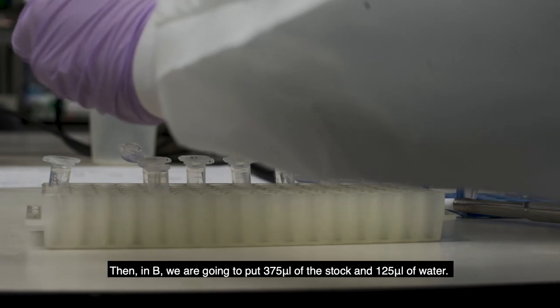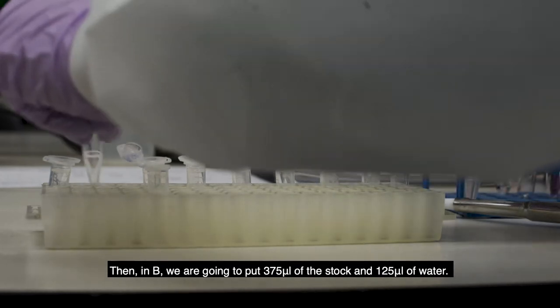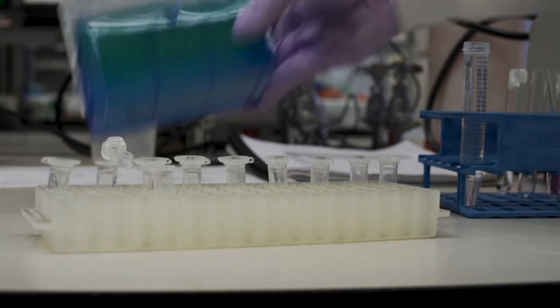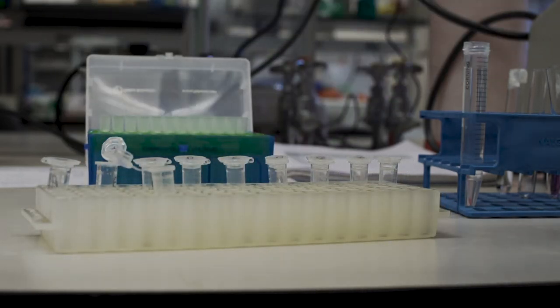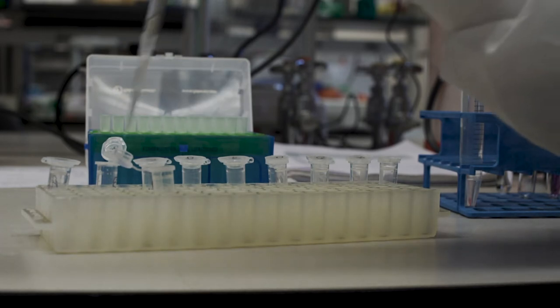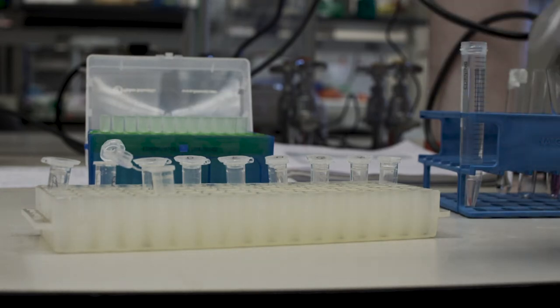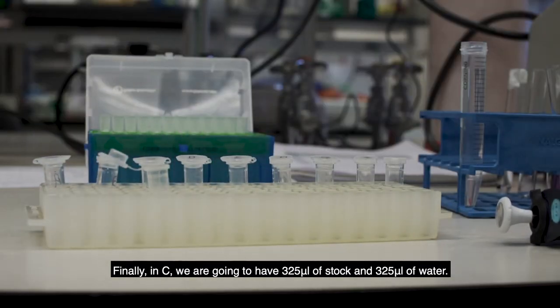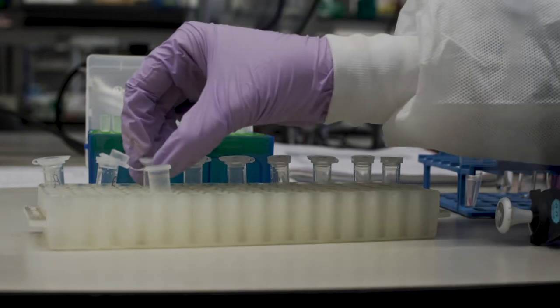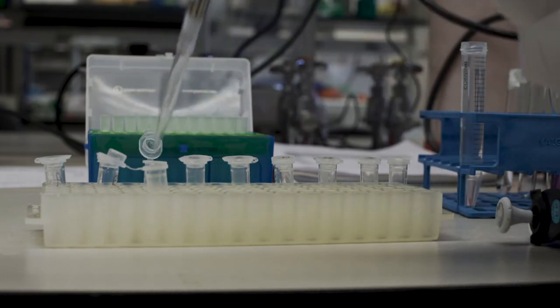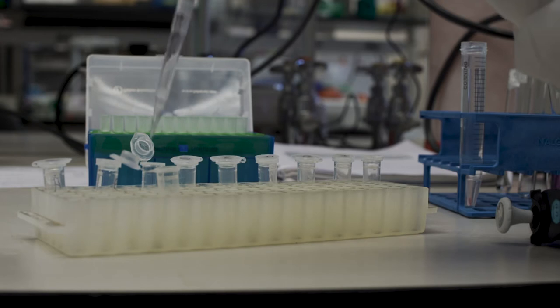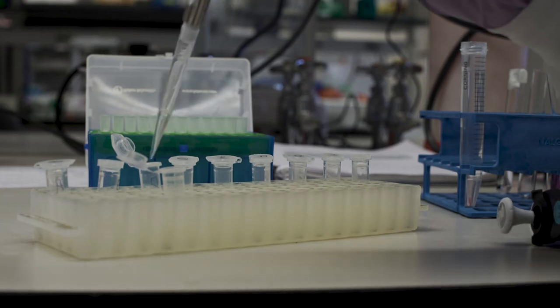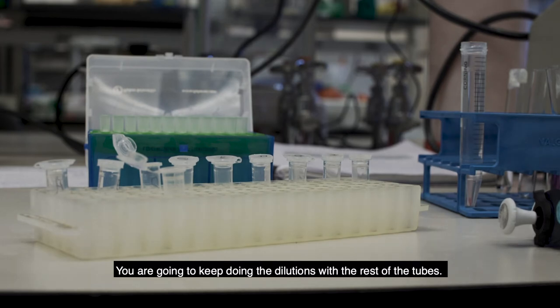And in B, we're going to put 375 microliters of the stock, and then 125 microliters of water. And then finally in C, we're going to have 325 microliters of stock, and then 325 microliters of water. And then you're just going to keep doing the dilutions with the rest of the tubes.